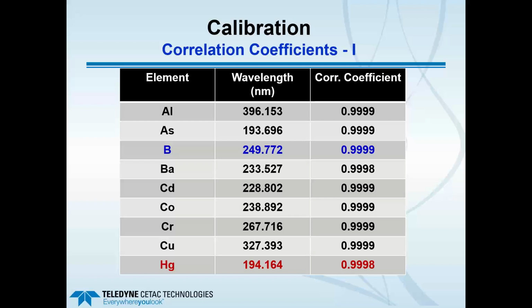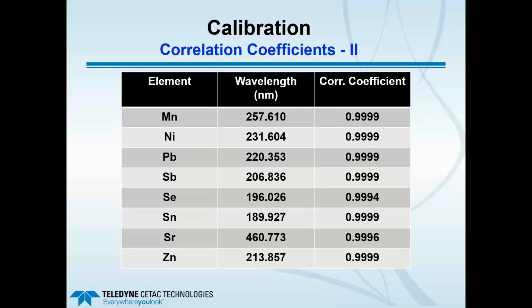The range of the correlation coefficients range from, I believe, 3 nines 4 to 4 nines. So calibrations were certainly, calibration curves were certainly satisfactory.